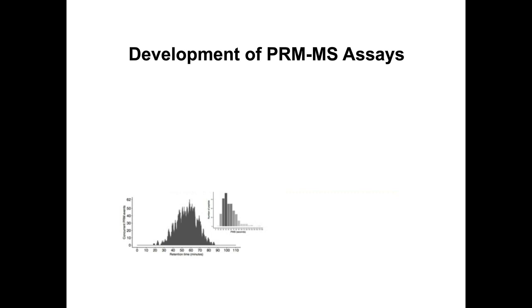In the next chromatogram shown here in blue is estimated cycle times that this would result in. Since we're targeting a lot of peptides, sometimes cycle times here, even with the short ion fill times, can actually get quite long. Nevertheless, with a peak that's about 45 seconds wide, that still gives enough data points to properly plot a curve for quantification.